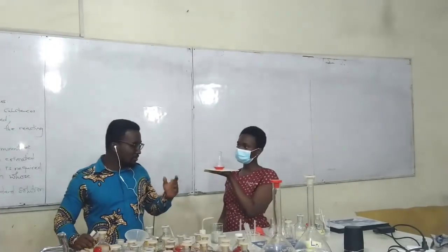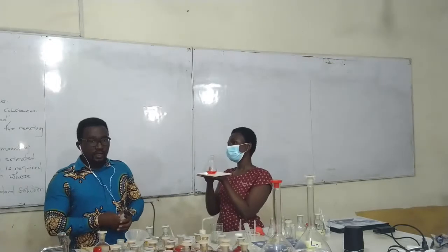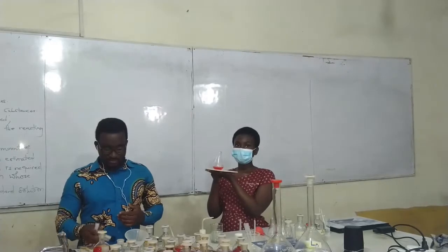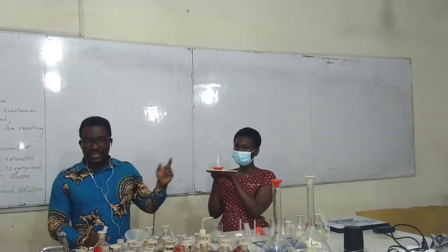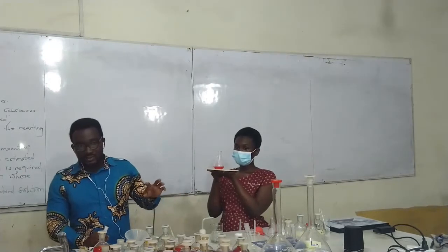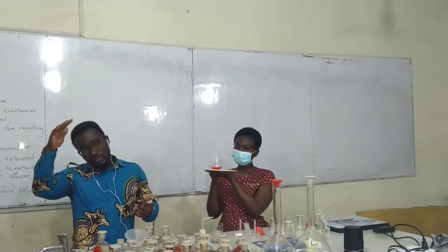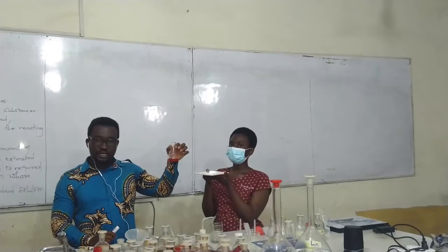Once again, let's take solution A to see the nature of the colors formed in solution A. In fact, this time we are going to look at methyl orange. We said the color was red. What does it signify? It signifies that the solution A, from theory, is acidic. Methyl orange in an acid is red. So it means solution A is acidic in nature, which means the pH ranges from somewhere around 4 downwards below and 2. That is why it has given us this category of color, red.